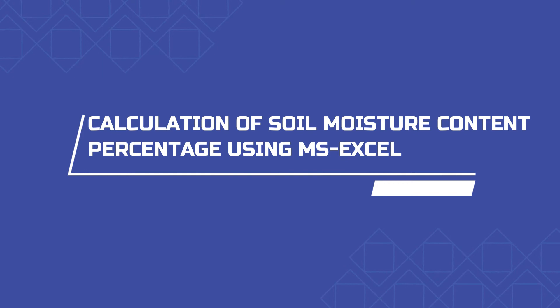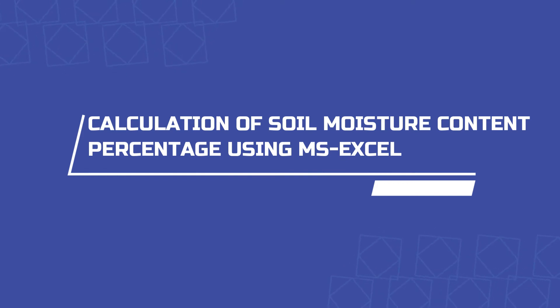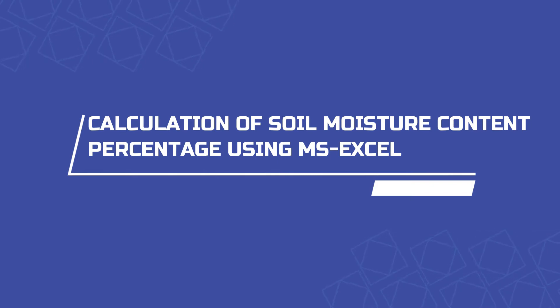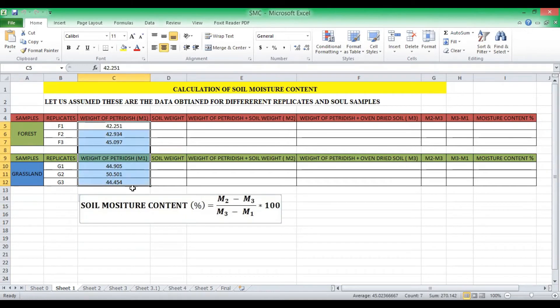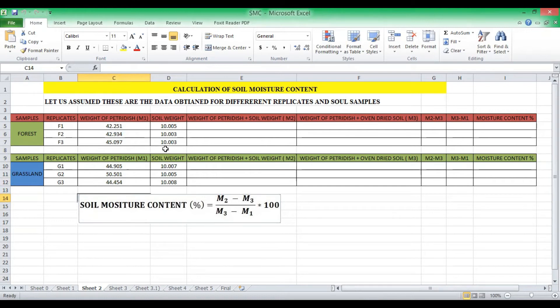The next stage is the determination of soil moisture content percentage using Microsoft Excel. The samples studied are forest soil samples and grassland soil samples. The weight of the petri dish, or M1 value, is recorded. To each petri dish we added 10 grams of soil samples, and the exact amounts added are recorded. To obtain M2 — weight of petri dish plus fresh soil — you add the M1 value and the weight of soil added.